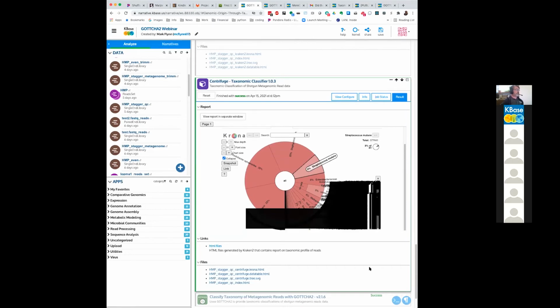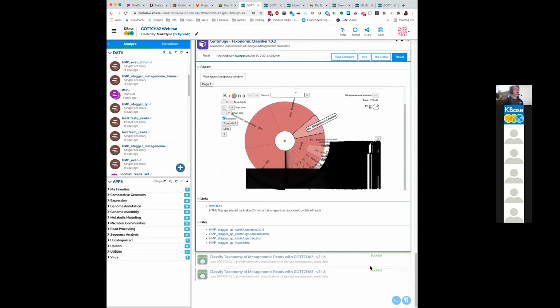So you'll notice that they're fairly easy to use, but if you're actually interested in doing a large number of samples and you want to run it using several apps, this actually gets very tedious. I did this for GSP last year, the 2019, where I had 20 or 30 samples that several of whom I wanted to run as a group or do the same exact thing, same exact analysis, and I wanted to do a comparison of them.